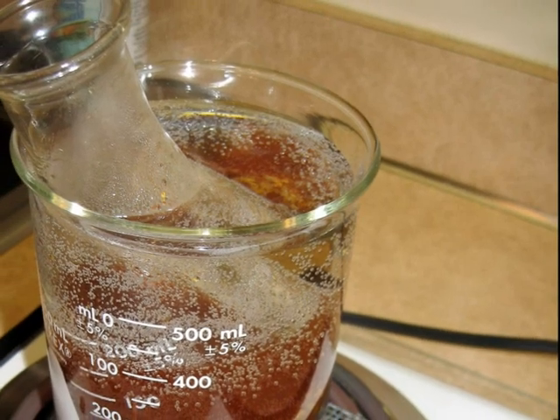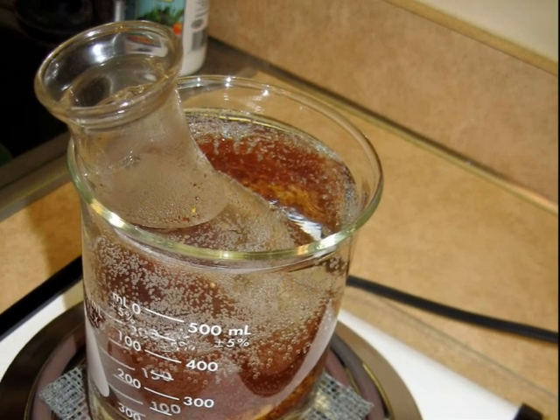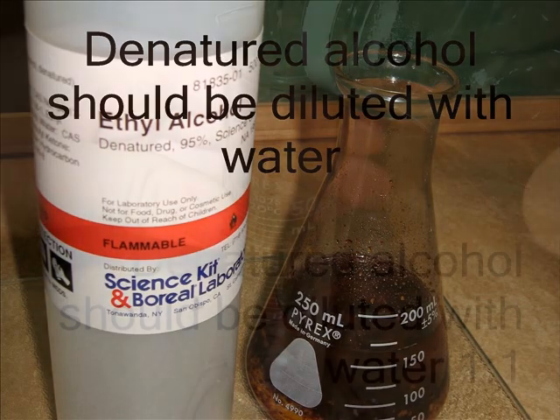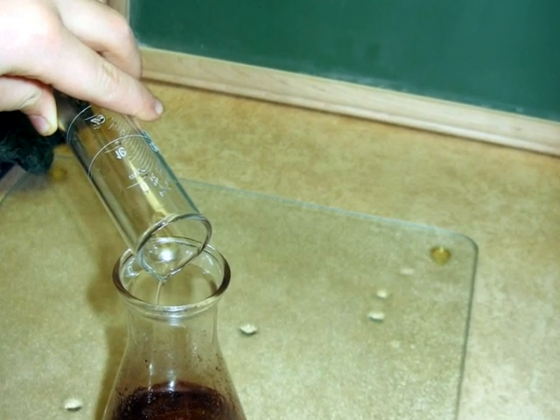Bring the water to a boil and then turn off the heat. Leave the vegetable oil mixture in the water bath for 1 hour. After the oil has cooled to room temperature, you will add ethyl alcohol. You will use 2 tablespoons or approximately 30 milliliters. Pour the alcohol into the vegetable oil mixture.